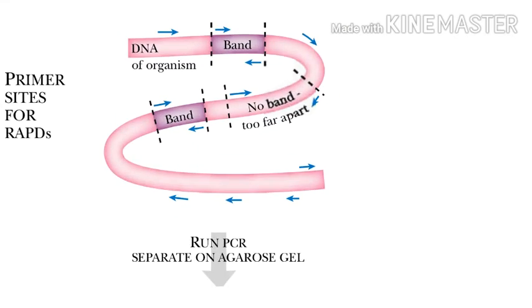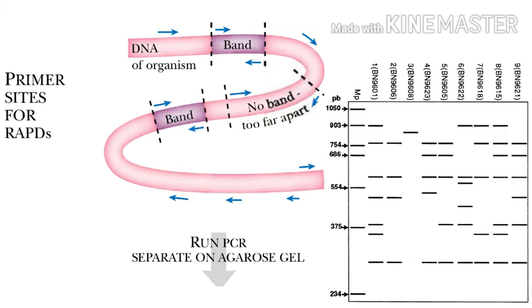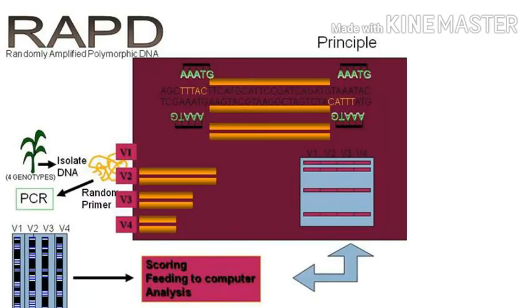This is approximately the amount of DNA in a bacterial cell. In other words, any chosen 11-base sequence is expected to occur by chance once only in the entire bacterial genome. For higher organisms, with much more DNA per cell, a longer sequence would be needed for uniqueness. For RAPDs, the arbitrarily chosen sequence should be rare but not unique.